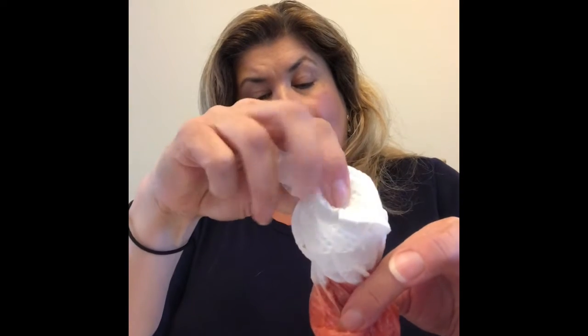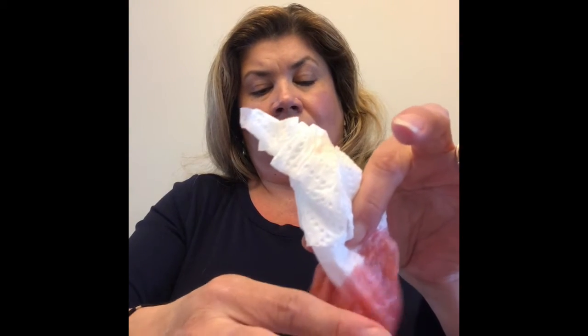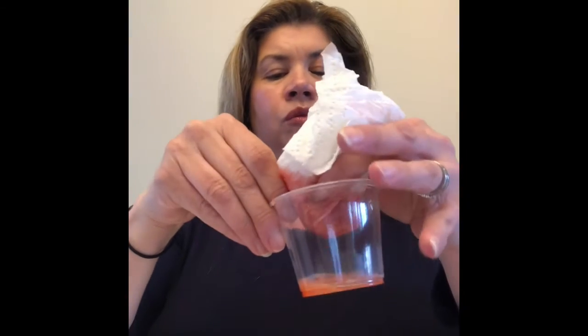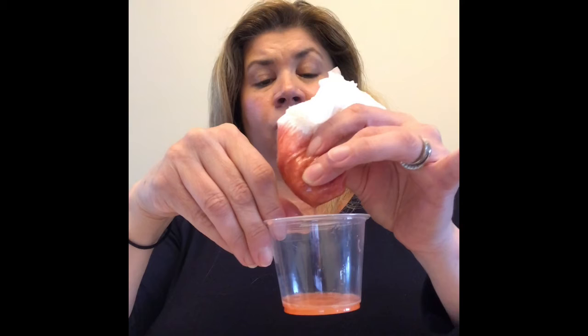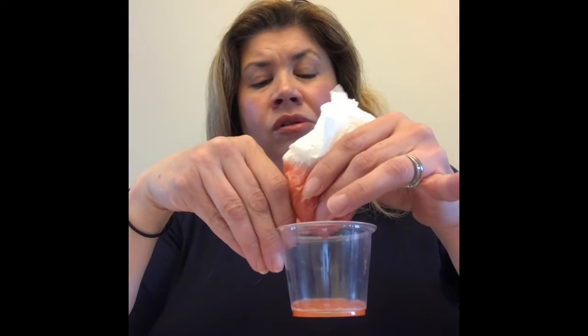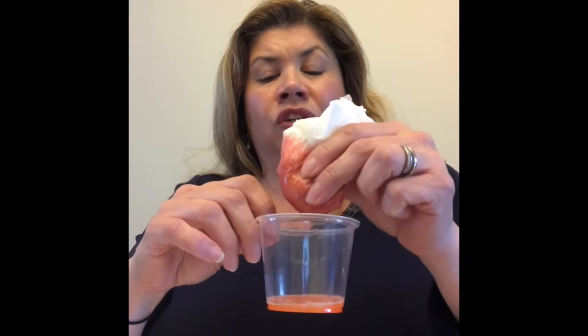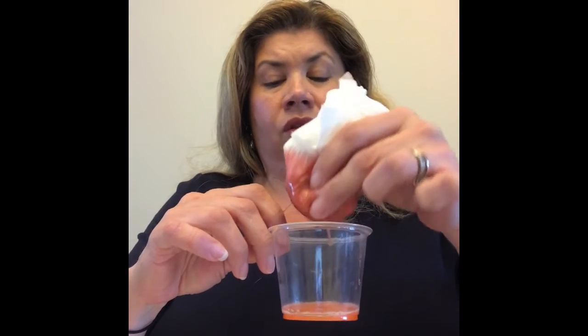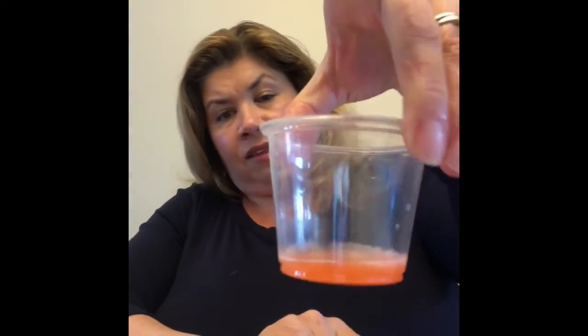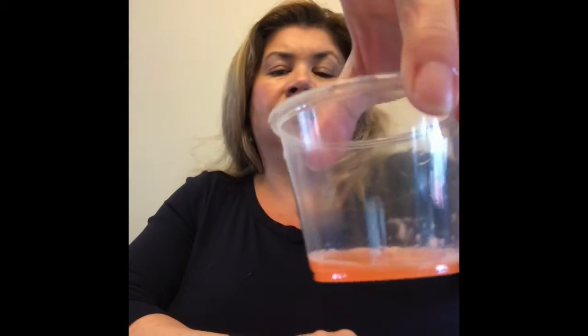You need just a little bit, maybe about half a teaspoon or a teaspoon. I want to make sure that if I give it a little squeeze, I don't make any holes in my filter or napkin, or get pulp from the strawberry in the cup. I only want our strawberry juice mixture, nothing else. That should be pretty good right there. So that's about how much I have. I'd say that's less than a teaspoon.